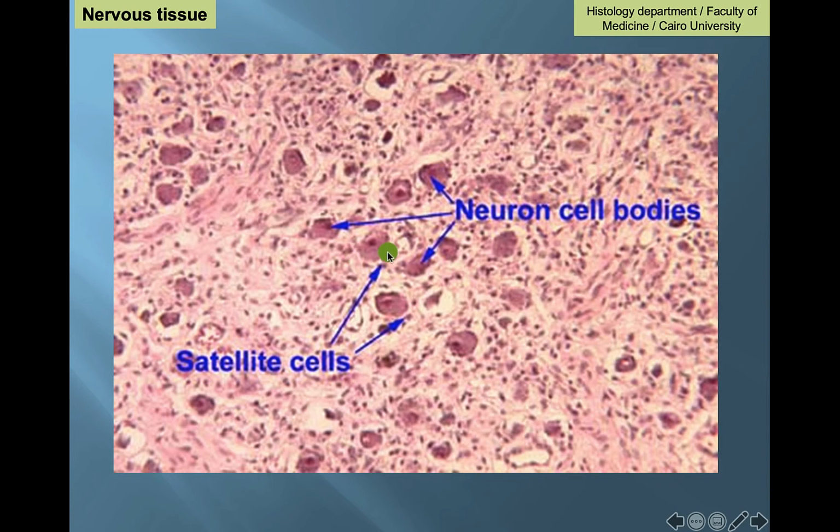They are neuroglial cells. So here there is always a mix-up between stellate, like a star, and satellite, which is like the satellite around these cells. In between we have what? We have unmyelinated nerve fibers, because the nerve fibers here are unmyelinated but provided with neurolemma.